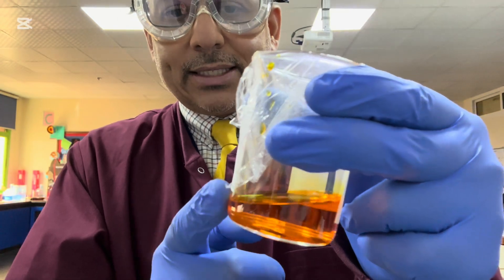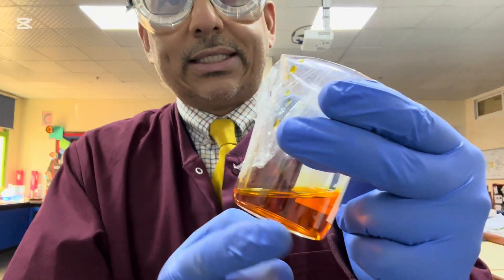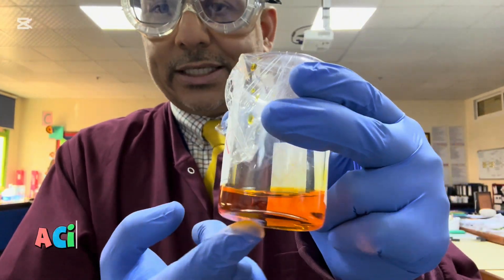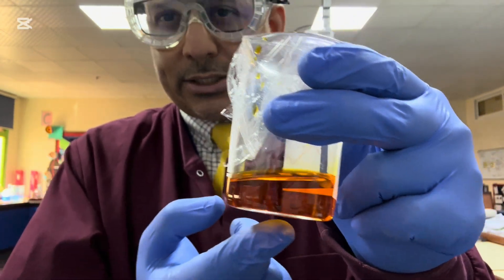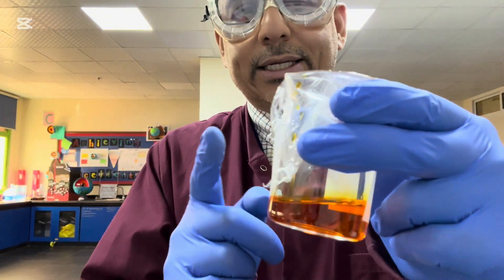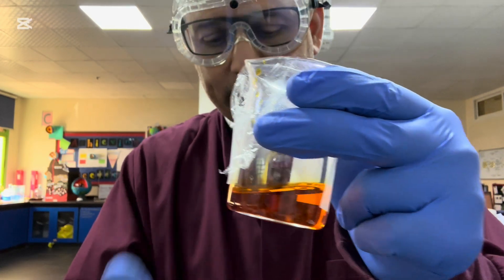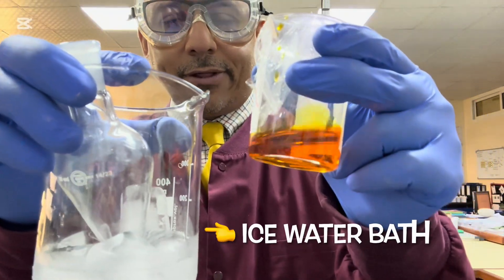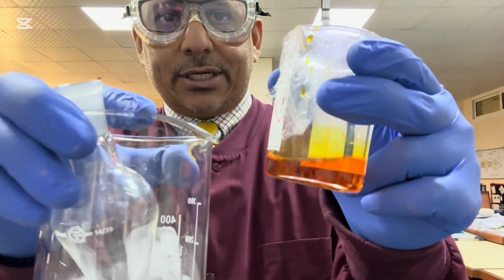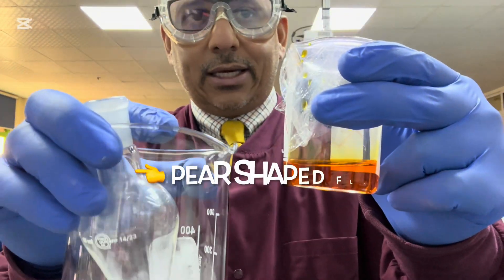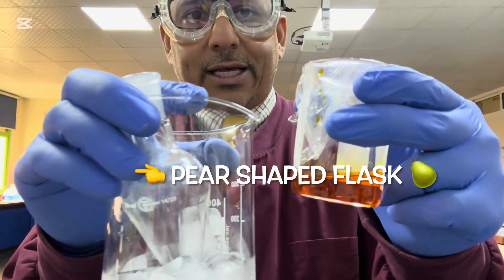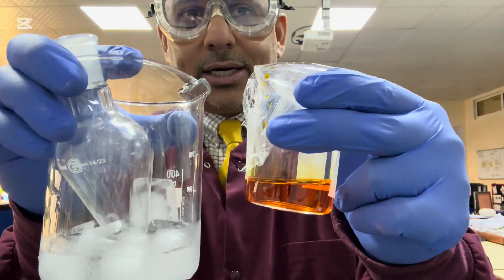This is the oxidizing agent. I've prepared some already. This is 20 centimeters cubed of acidified potassium dichromate solution, and what I need to do for the first step is I need to cool this down in an ice water bath. I'm going to very carefully add this 20 centimeters cubed of acidified potassium dichromate solution to this 50 centimeters cubed pear-shaped flask, and I'm going to cool it down in an ice bath.